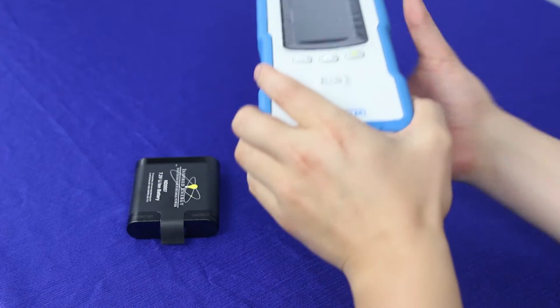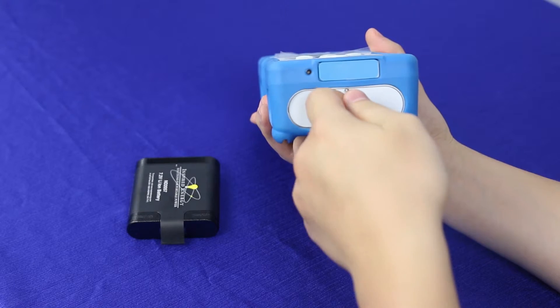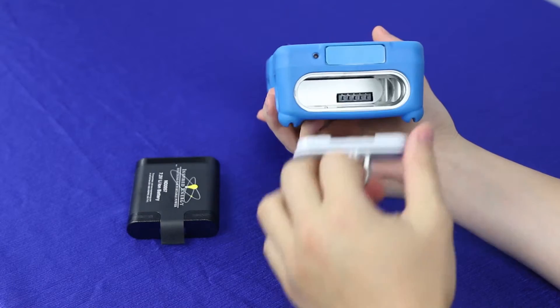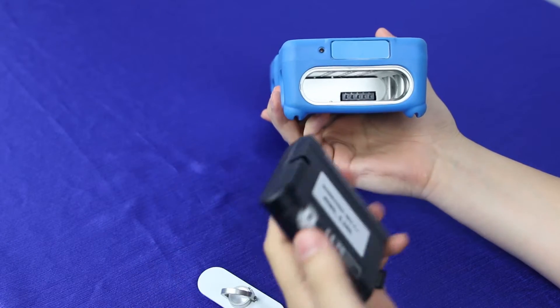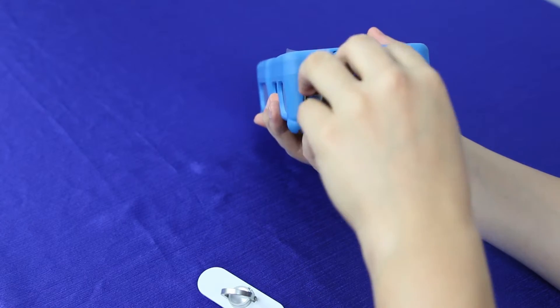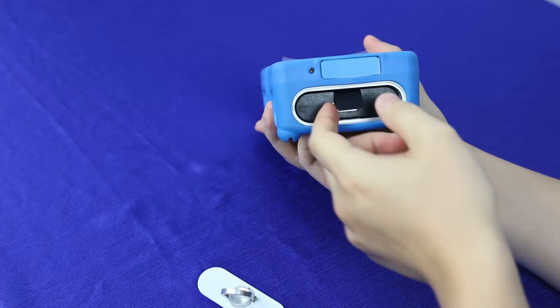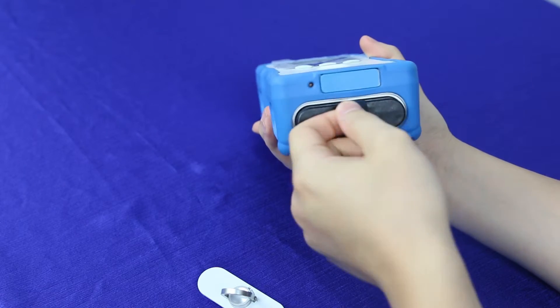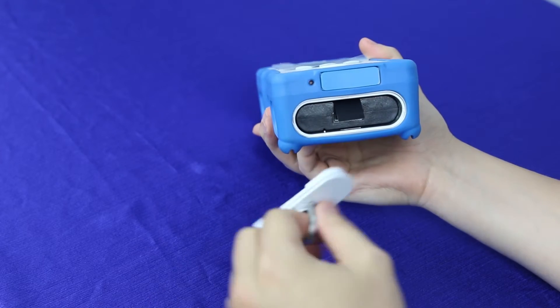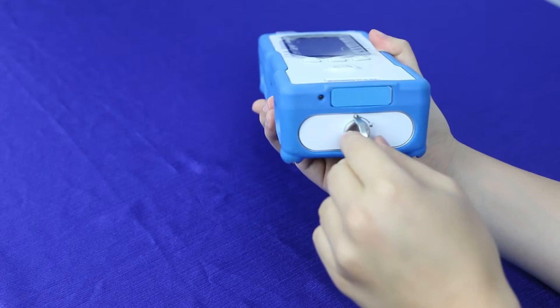To put the battery into the NanoRam, take the battery compartment door, turn it clockwise, and pull it out. Then take your battery and match up the battery contacts to the bottom, put it in, and once it clicks it's in. There's also a tab for easy removal. Then take your battery door and screw it back in.